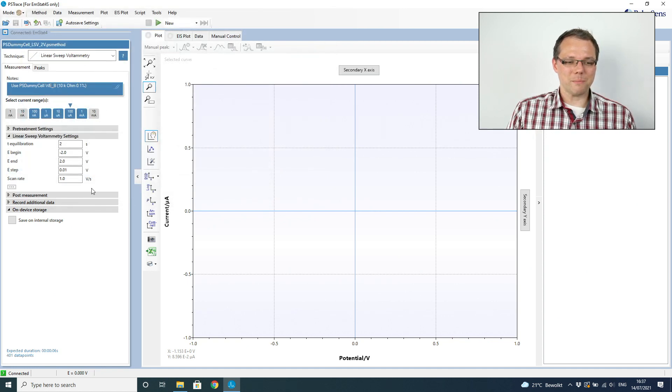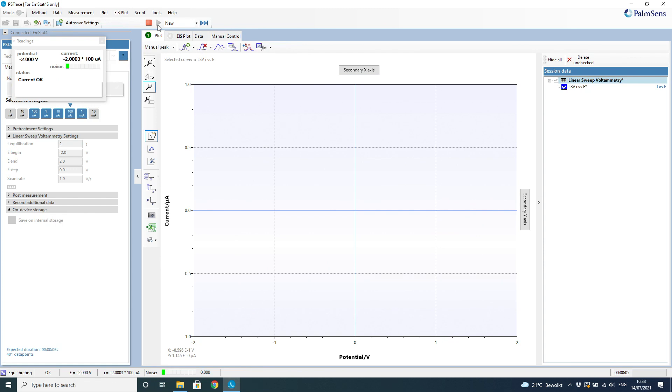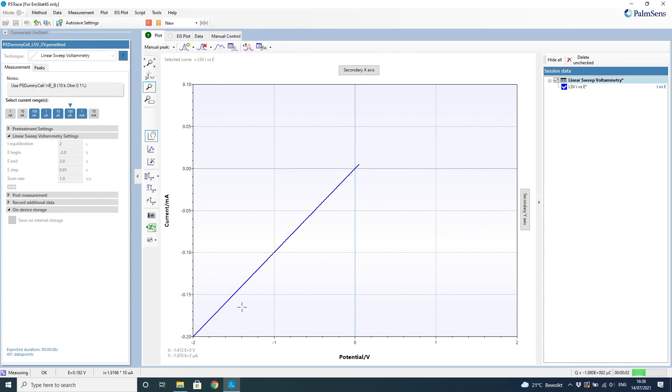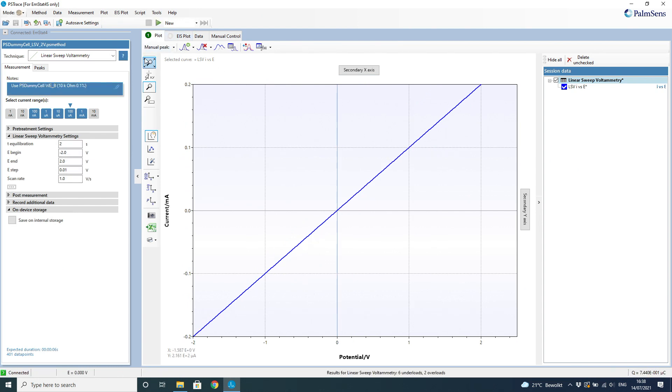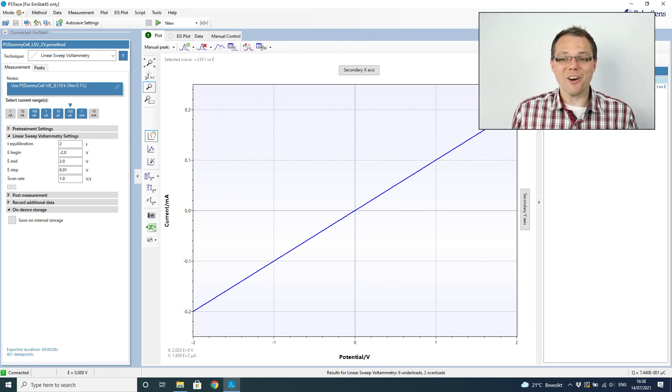Then we press the start button — the green button — which is only green when the instrument is correctly connected. We've set our parameters, so we're good to go. And we do get a straight diagonal line, which is exactly what we expect for a resistor. We start at minus 2 volts, and for a 10 kilo-ohm resistor we get minus 0.2 milliampere, and we end up at 2 volts getting 0.2 milliampere. We successfully completed our first measurement with the EmStat 4S in just a very short amount of time.